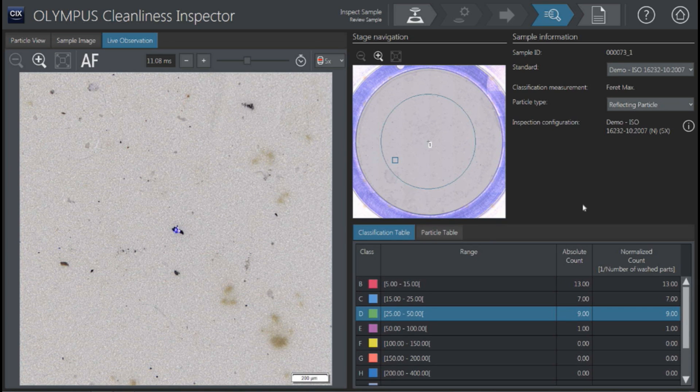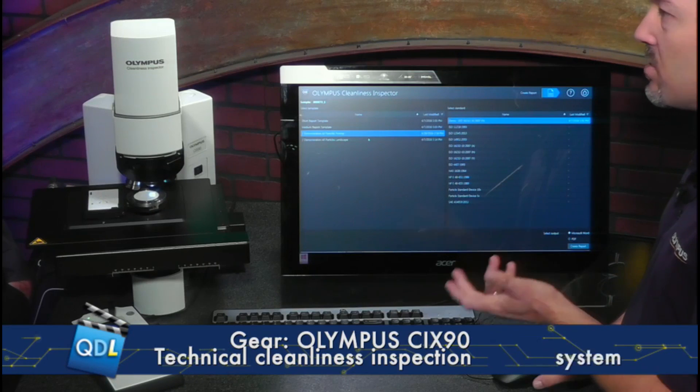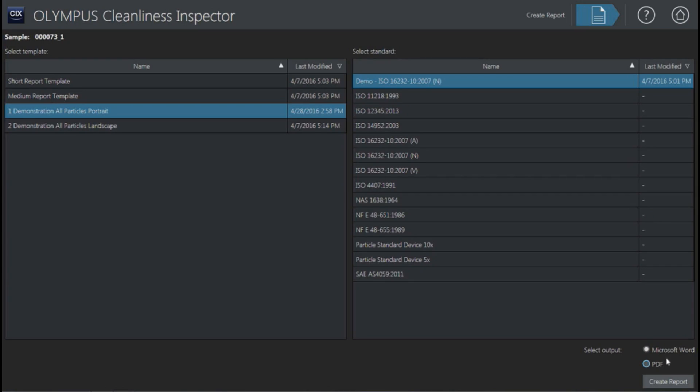Once they review all of their results, they will want to take the next step and create a report. At the end of the process up here, we hit create report. We can select from multiple different templates — custom templates for different parts with different requirements. These are just Word document templates. We can create either a Word document or PDF document. We hit create report and assign a name to that report, and it's going to take all of that data and compile it into the document.